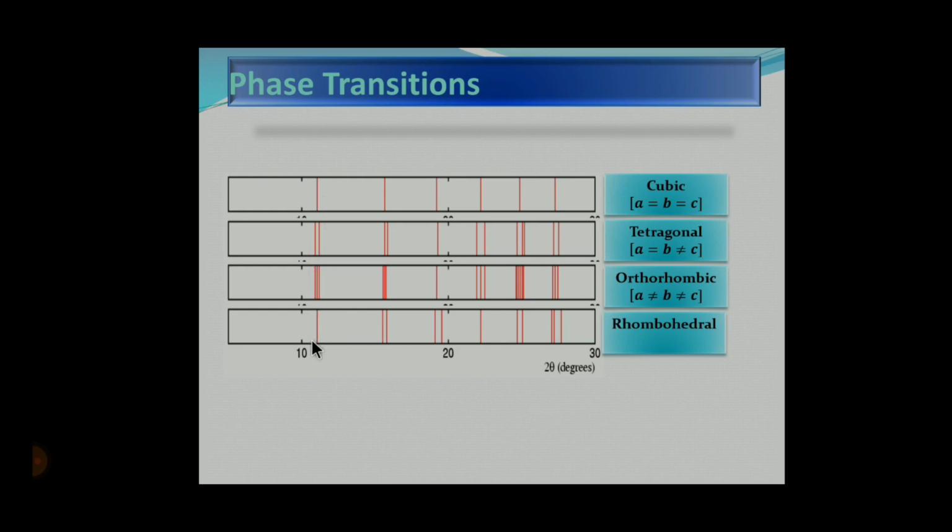So like this, by doing in situ XRD, that means we are taking the XRD while the reaction is occurring and analyzing the patterns, we can clearly define the kind of structure it has or the phase transitions that are happening inside the material.